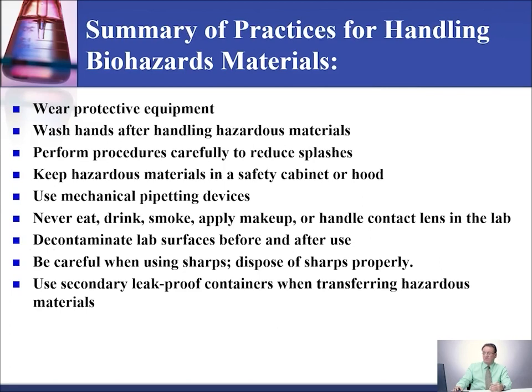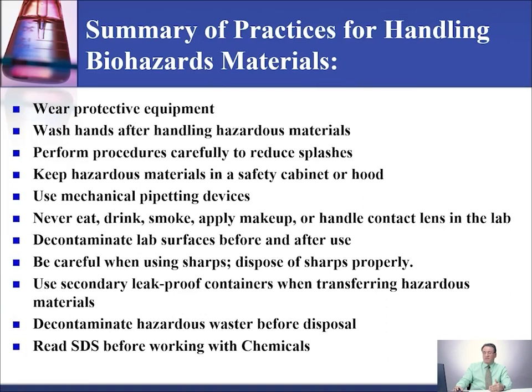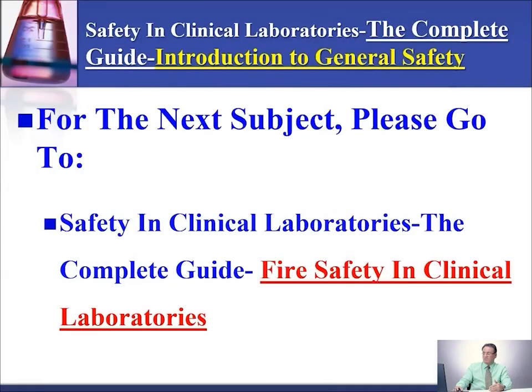Document that and initial it. Be careful when using sharps. Dispose of sharps properly. Use a secondary leak-proof container when transferring hazardous material. Decontaminate hazardous waste before disposal. And read the SDS, safety data sheet, before working with chemicals.